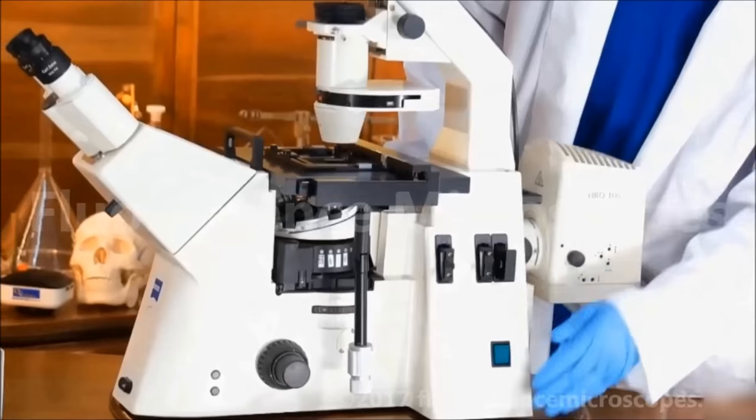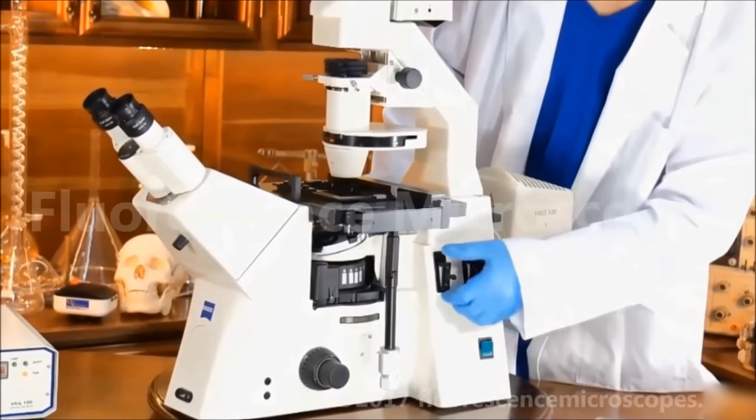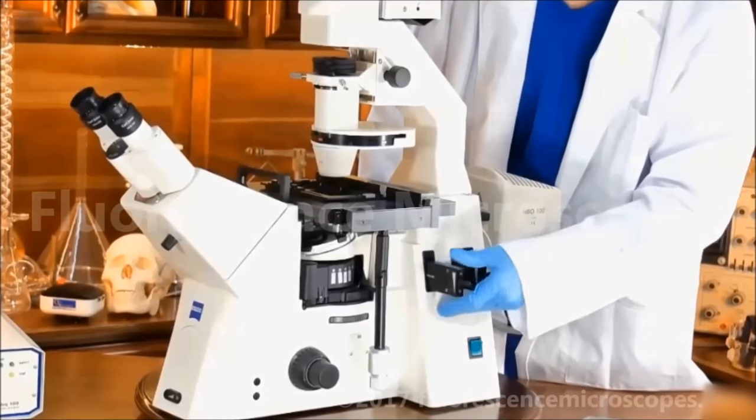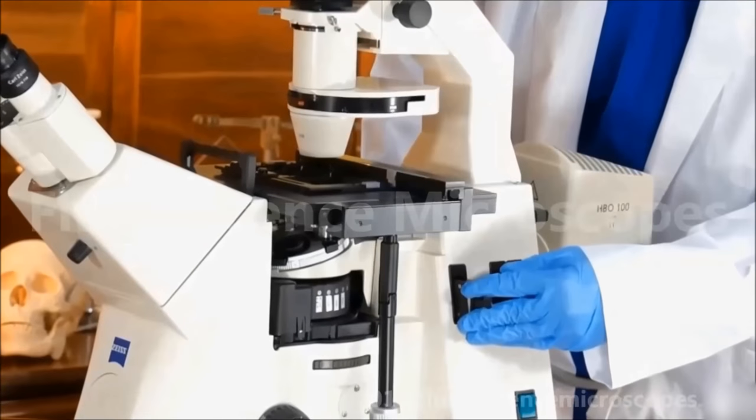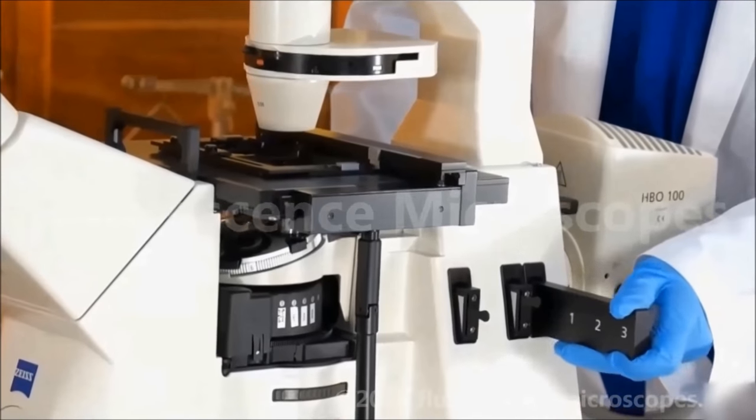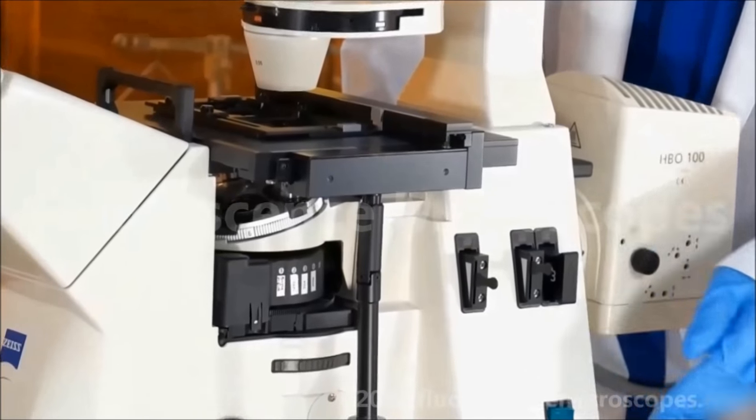This button turns on the halogen lamp. This is the halogen lamp. These are your diaphragms, iris diaphragms, field stop and aperture stop, and you've also got your sliders where you can put different filters in.